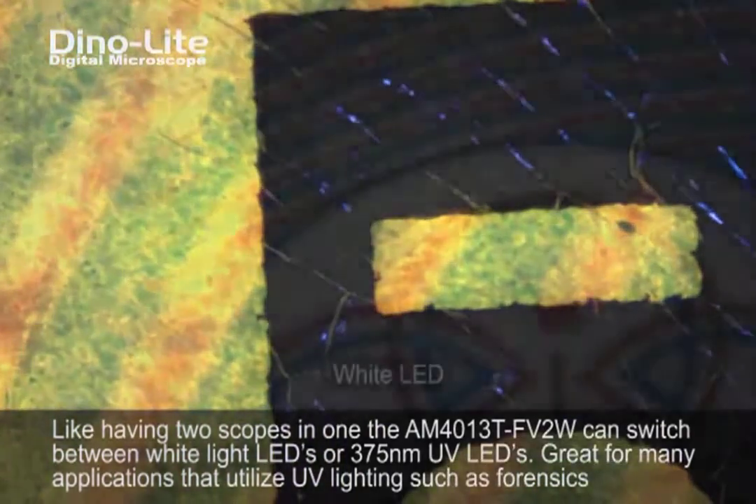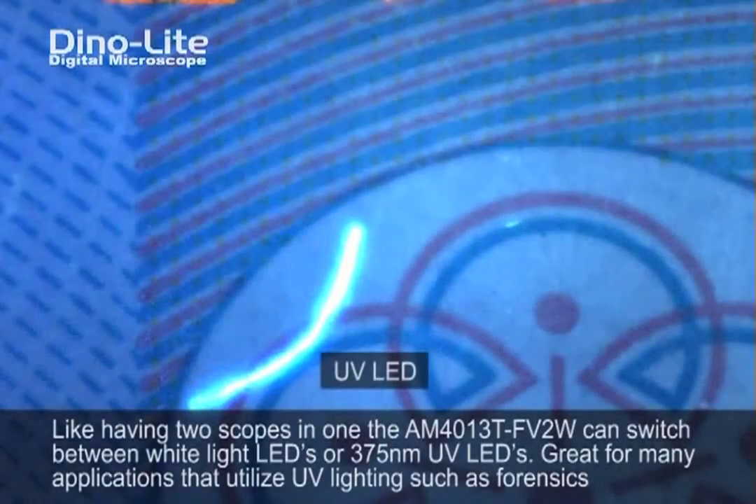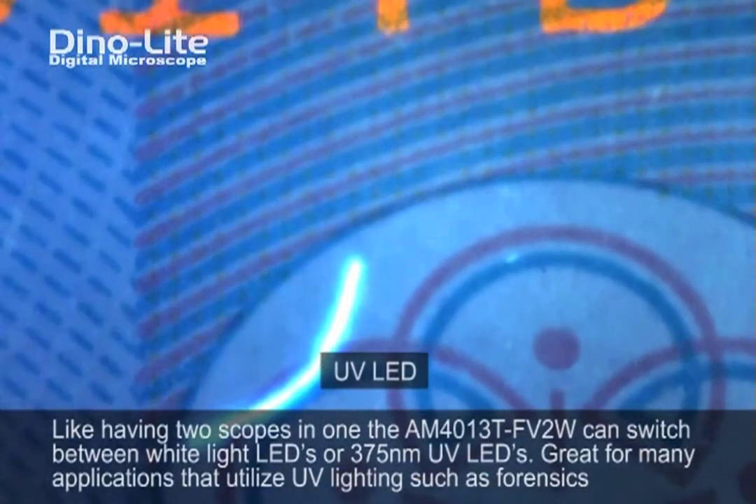As you can see within our demonstration, we are using a number of different objects and looking to see if anything fluoresces on them or if they have any identifying markings.